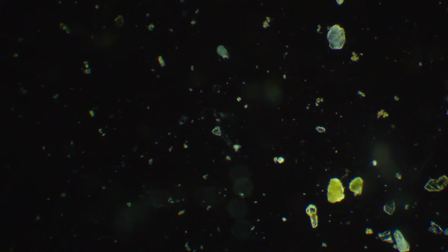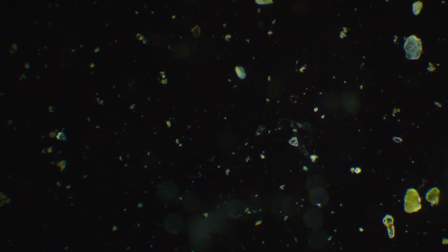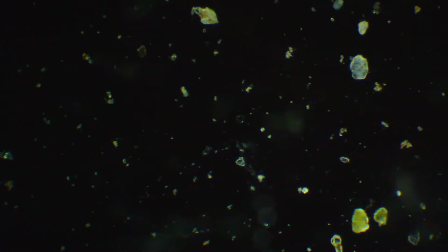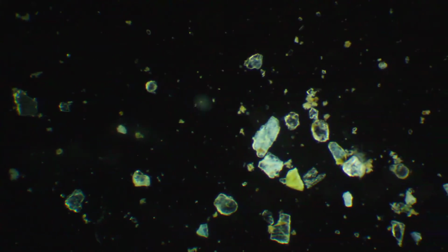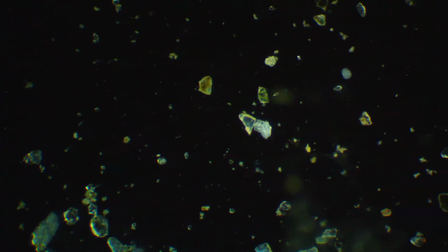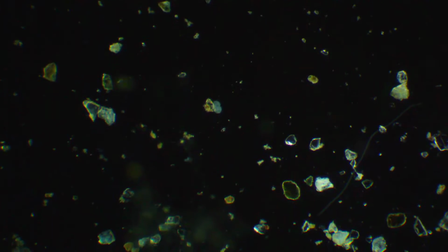So I have to move the stage around on the microscope. There's two knobs, one goes side to side, one makes it go up and down, forward and back, I guess. And yeah. Man, what happened? He freaked out. Did you see that? He flipped out. He said, nah, forget this. I'm coming over here.